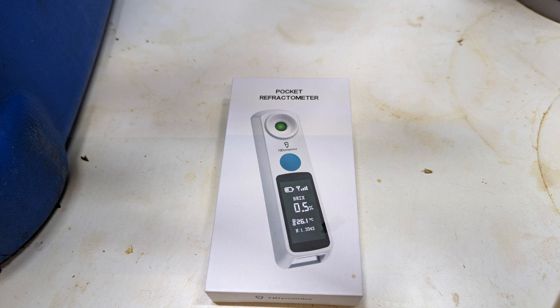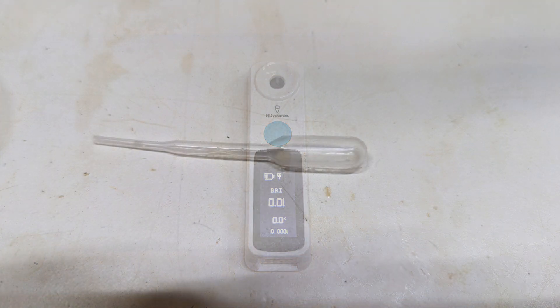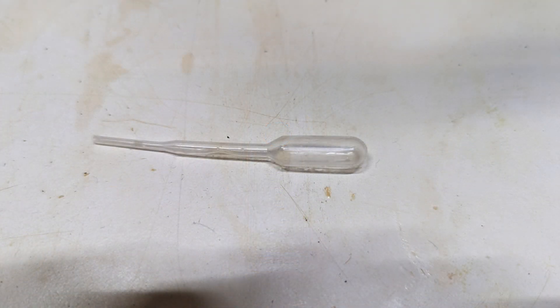It comes packed neatly in a small box and inside is the device itself, which is maybe three centimeters by two centimeters by ten, so really small and tidy. It comes with some tiny, neat little pipettes to use it with.